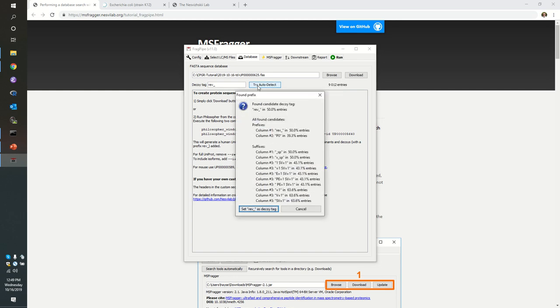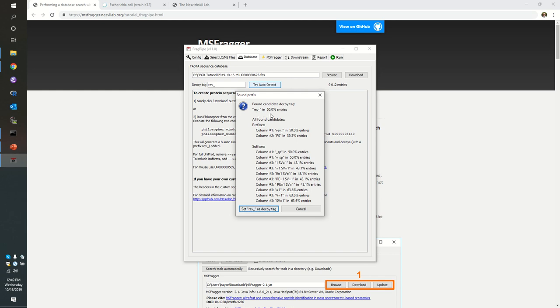This auto detect mode is a really handy way to figure that out retroactively. So given a fasta sequence database, the software can tell you which labels are likely used to denote the decoys from the targets. In this case, we want the decoys to be exactly half the database. So seeing that rev underscore is found in exactly 50% of the entries is good news.